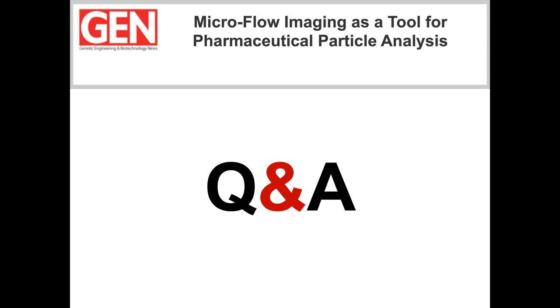Thanks very much, Case. Miranda, another question for you guys. This is a question concerning the fines population that is detected by the MFI but not with the Mastersizer. How do you know that these fines detected with MFI are not artifacts or contaminants that appear during sample preparation or MFI measurement?